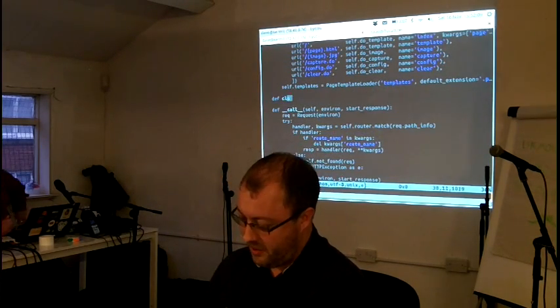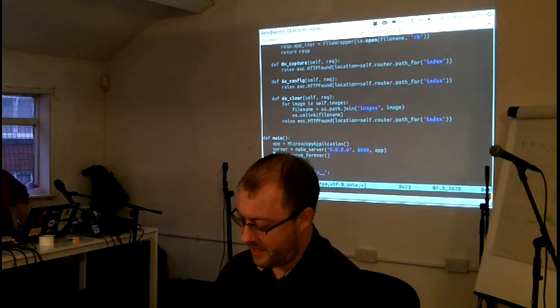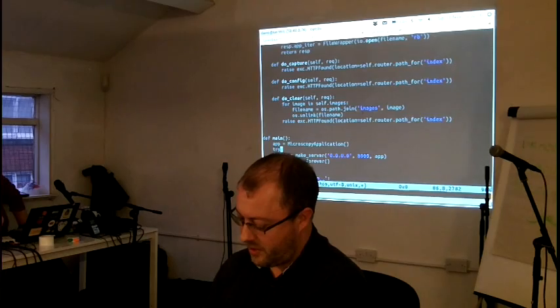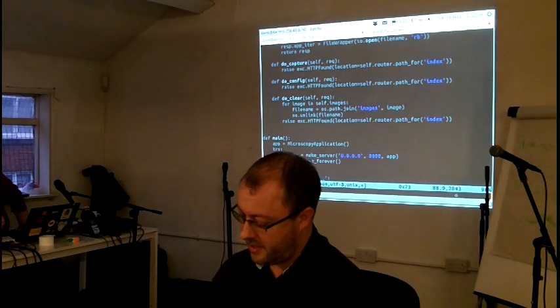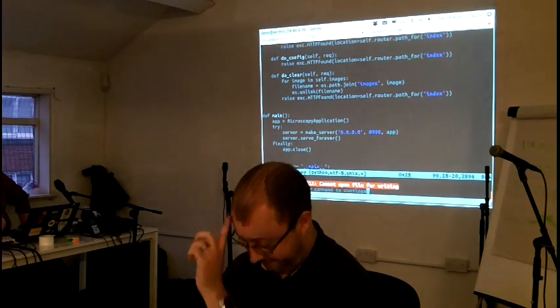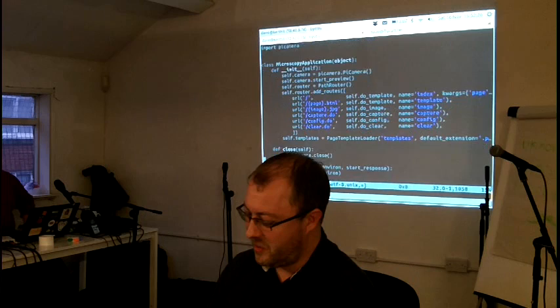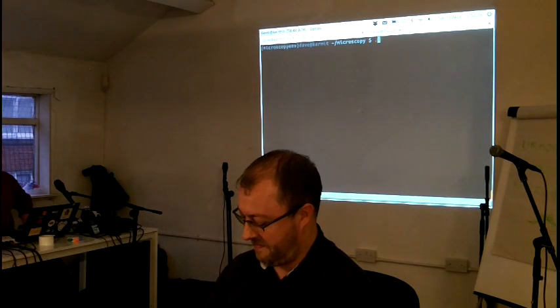We always need to uninitialize the camera at the end. We're going to close, and we want to ensure that that close runs, so we have a finally block at the end to close the application. Ooh, that's just not writing, is it? Well, we shall see how this goes.